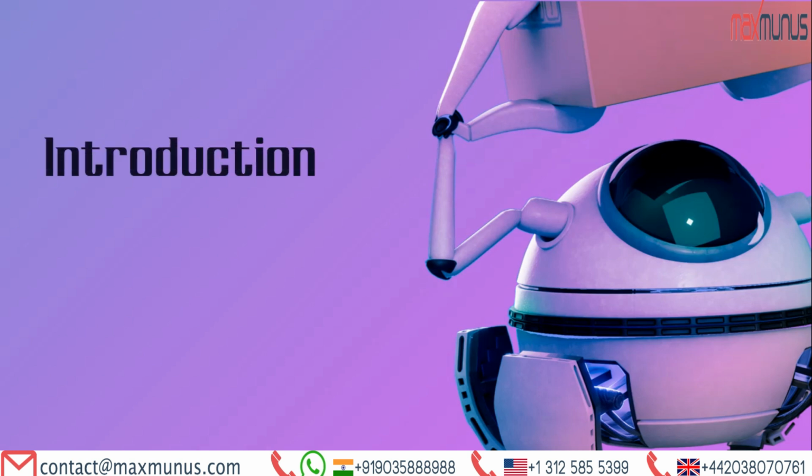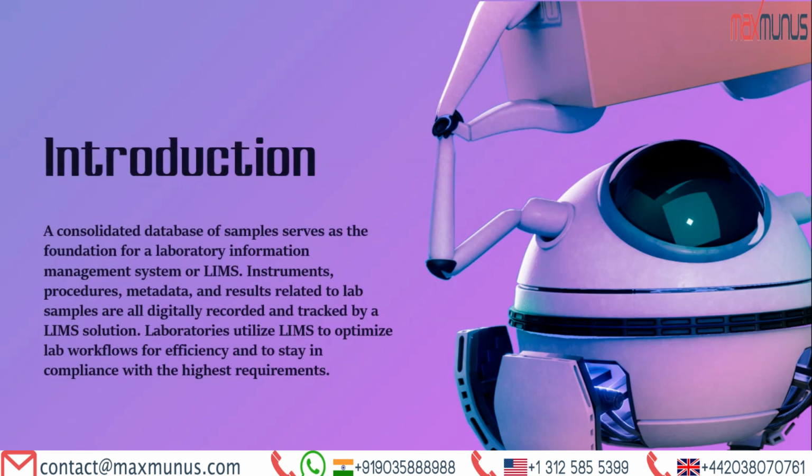Let's understand the core of our training. What is called Labware LIMS? A consolidated database of samples serves as the foundation of a laboratory information management system, or LIMS. Instruments, procedures, metadata and results related to lab samples are all digitally recorded and tracked by a LIMS solution. Laboratories utilize LIMS to optimize lab workflows for efficiency and to stay in compliance with the highest requirements.